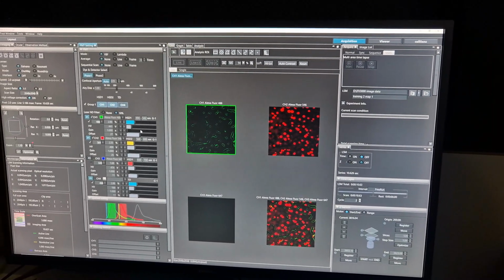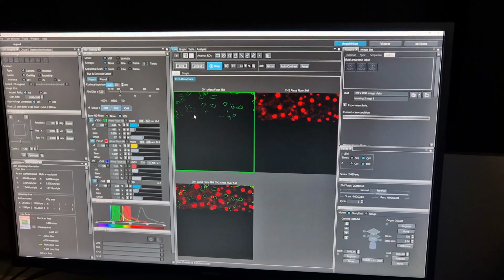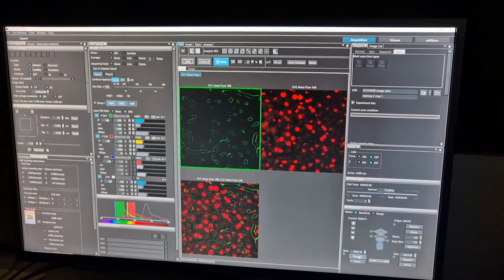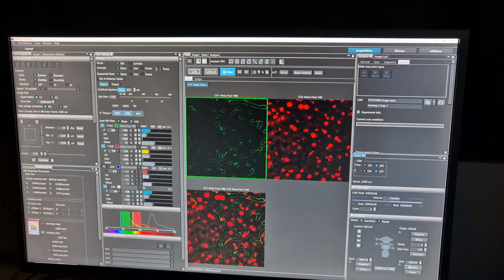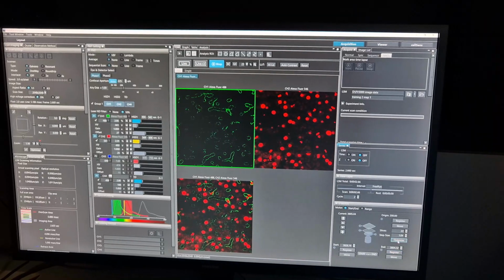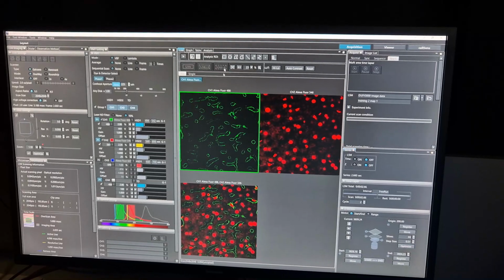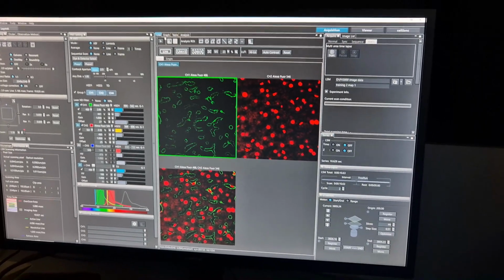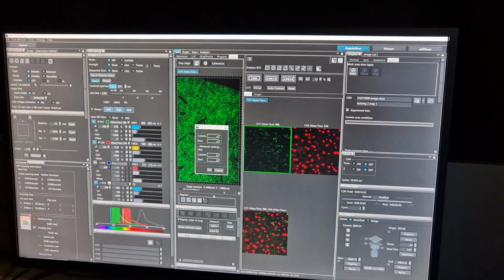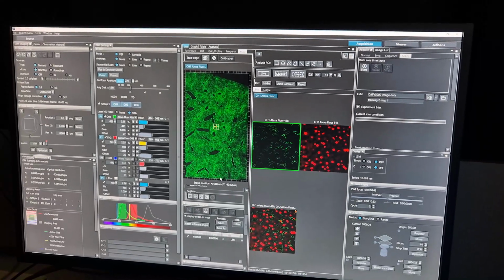Phase 1. So live again. No. Okay, so we'll go to the MATL tool by hitting that. And we'll register a smaller area here, 2x2, press OK.